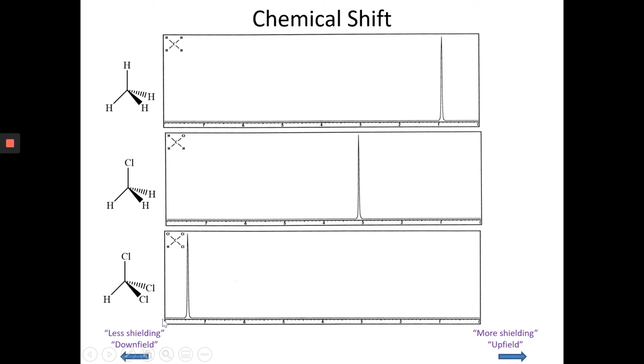So it doesn't increase linearly like this, but it's always the case that if one functional group has a chemical shift of, let's say X, then if you have multiple of those groups, the chemical shift is always going to be bigger than X. In other words, you're always pushing things downfield because pretty much all functional groups are going to be more electronegative than carbon and hydrogen. And because they're more electronegative, they're going to suck electron density away and push things further downfield. But you can't just multiply by 2 or multiply by 3. It's not quite that simple.